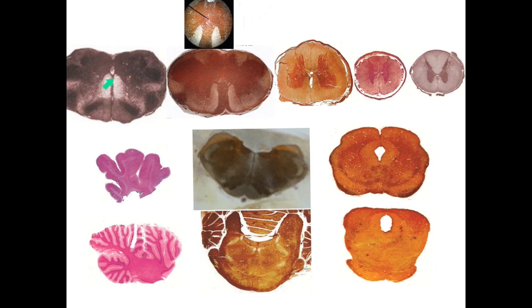Then we have here the closed medulla, because there is a central canal but no H, and we have here two pyramids marked by this mustache made of the medial accessory olivary nucleus. So this is the closed medulla sensory decussation.